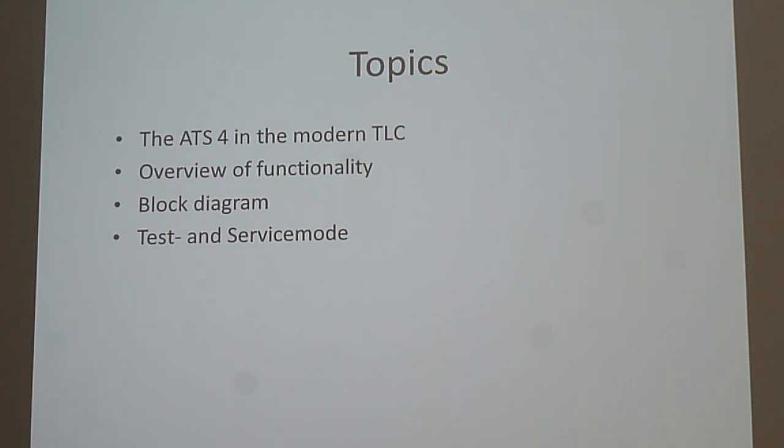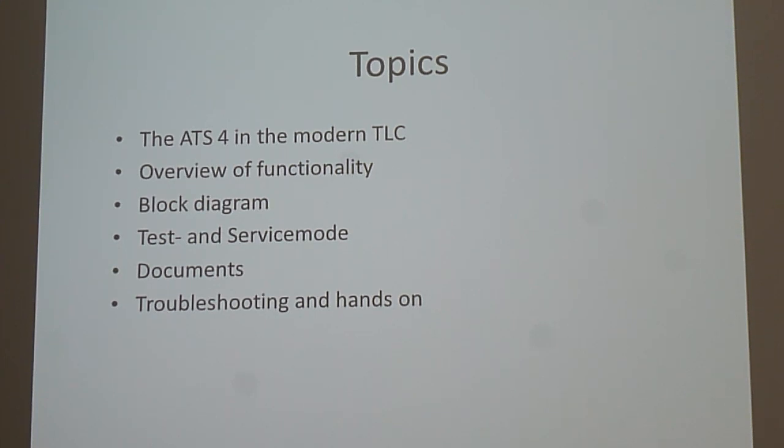When you have to adjust the stepping motors if something is not in line, especially for the application lift, or something on the table, or something on the rack is not in the right line. Then we also have documents, certifications, and in the end we also have troubleshooting together, and then we make it hands-on. That's what we want to do.